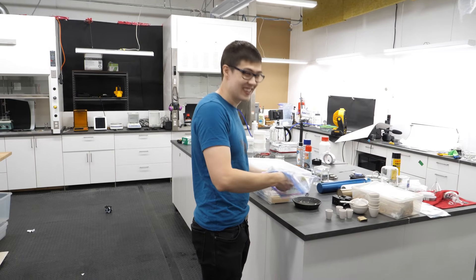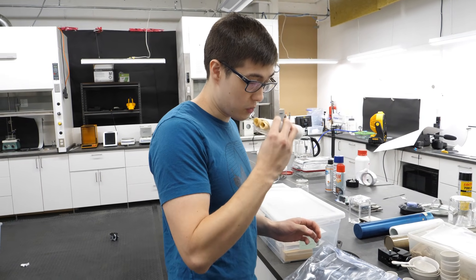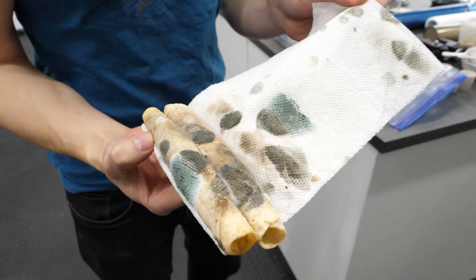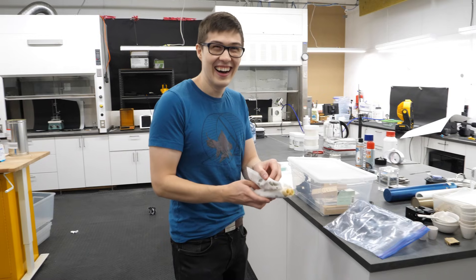That's not going to smell good in the machine. I'll put it in a bag. Okay, I'll bag it. It doesn't smell that bad, but... That's weird. It smells like solvents.